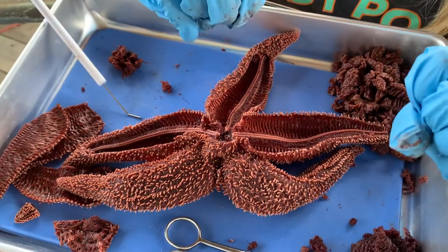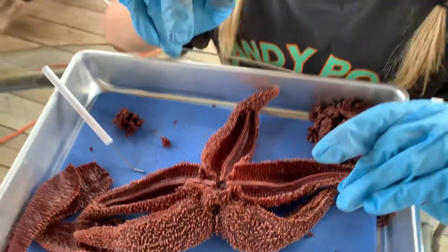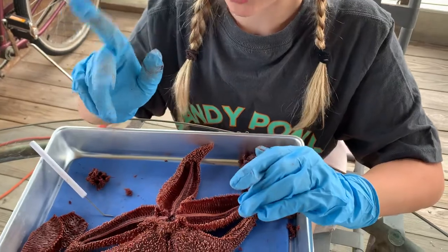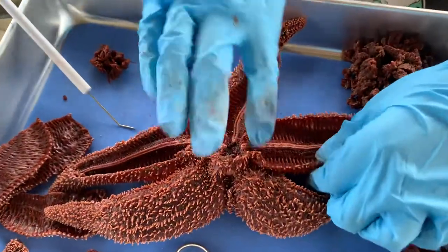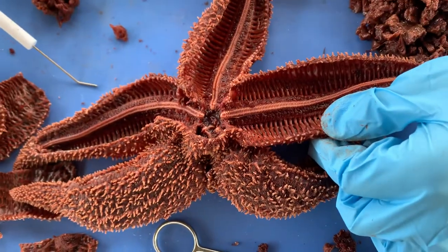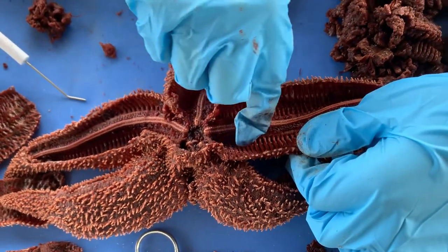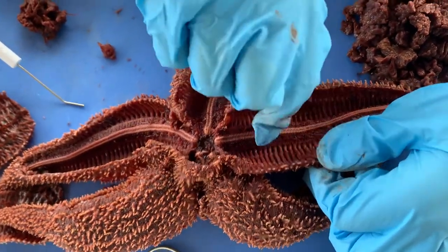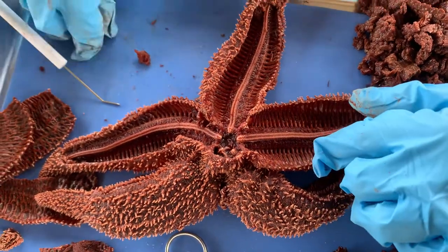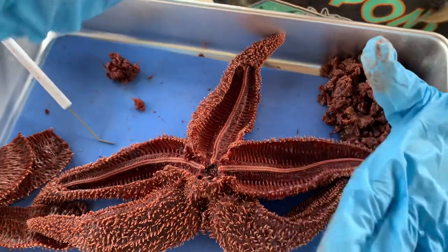The ossicles — and I'm sorry if I pronounced this wrong — the ossicles are almost the ribs of the starfish. If you're thinking of a human structure, the spine and then the ribs, that's the ambulacral ridge and the ossicles. And of course, the pyloric stomach and the pyloric ducts.